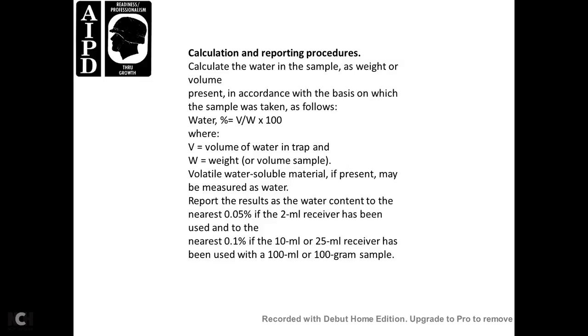Calculation and reporting procedure. Calculate the water in the sample, by weight or volume depending on the basis on which the sample was taken, as follows. Water percentage equals the volume of the water in the trap times 100, divided by the weight or volume of the sample.